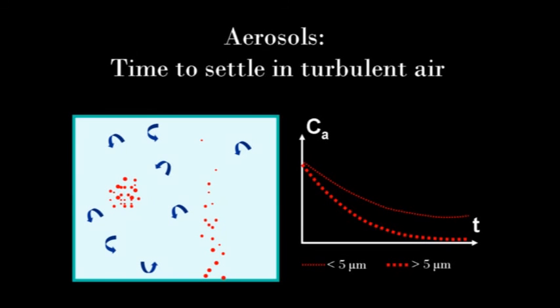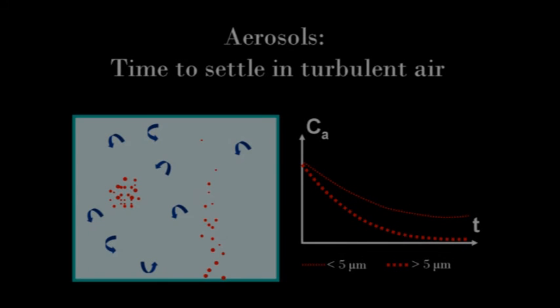Particles with a diameter of 5 microns or less can remain airborne for a long period of time, spread wide distances, and are easily inhaled. Larger particles settle rapidly and can contaminate skin, equipment, other surfaces, and ventilation systems. When performing work with infectious agents, appropriate measures must be taken to protect workers and the environment.